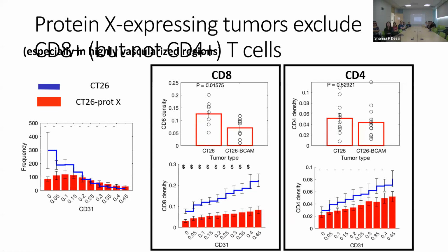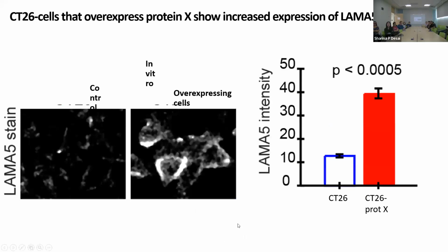And you can just do it, and I think it may even help reproducibility sometimes. I'm not saying that looking at the whole tumor is a bad thing; ultimately you need the whole tumor and something needs to be different. But it's possible that you have two different effects, like the vascular density goes up and then there's another effect. When you normalize, looking at the cytotoxic T cell density relative to vascular density, you may find a clearer effect that you wouldn't see when you're just pooling the whole thing together. Anyway, it's one way to do it, and that's what this confocal microscope can do. You have a tissue, you can look at the whole tissue and you quantify it.